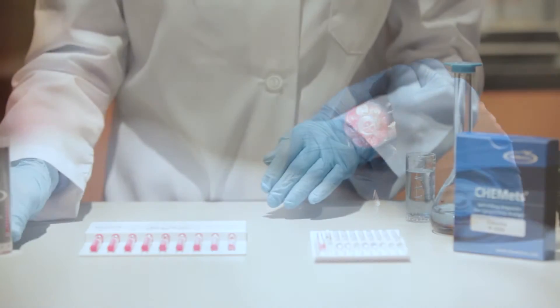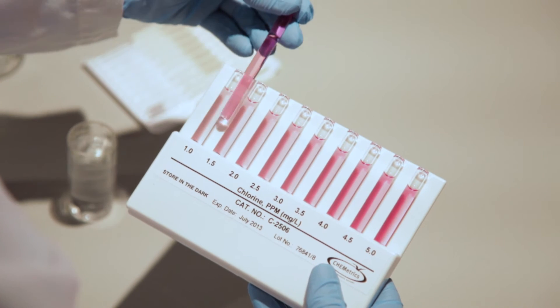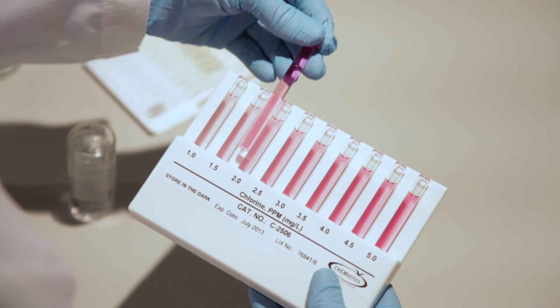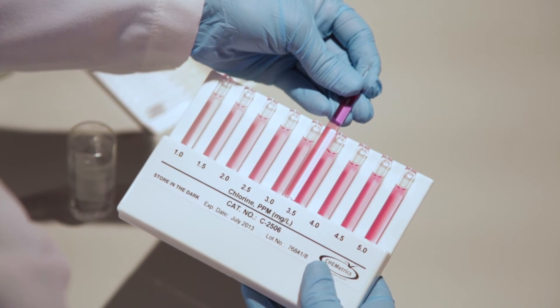For higher concentrations, hold the flat comparator in a nearly horizontal position while standing directly beneath the source of light. Place the ampule between the color standards, moving it along the comparator until the best color match is found.